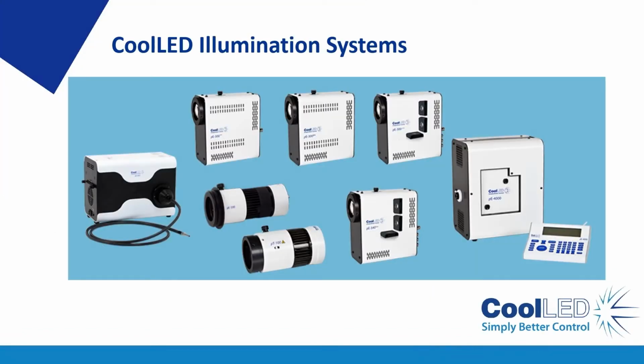At CoolLED we offer a wide range of illumination systems, from the single wavelength pE-100 and pT-100 series through to the broad spectrum pE-300 series and specialist pE-340 fura. There are also multiple controllable LED options such as the pE-4000 and our new flagship pE-800 series, which includes the pE-800 fura that we will be focusing on in this webinar. Our illumination systems are compatible with most microscopes using adapters that we have developed.